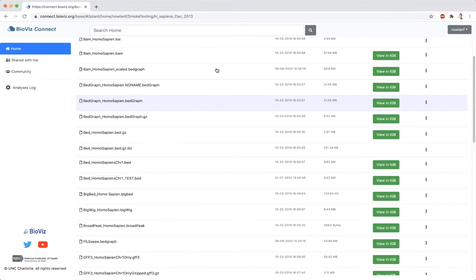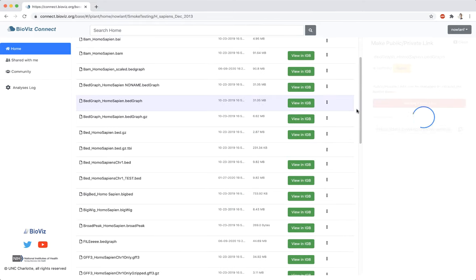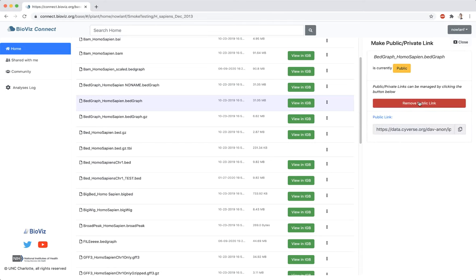To make a file private, right-click on the file in BioVizConnect and select Manage Link. Then click on Remove Public Link.